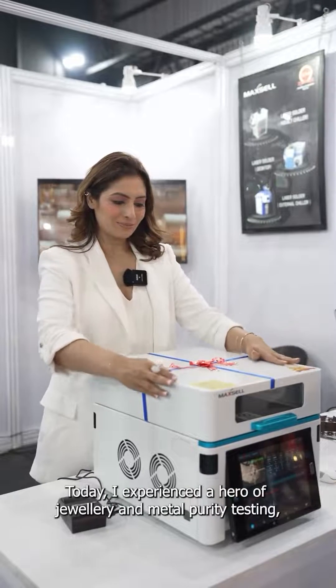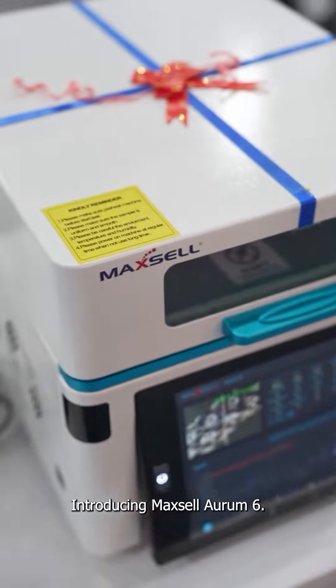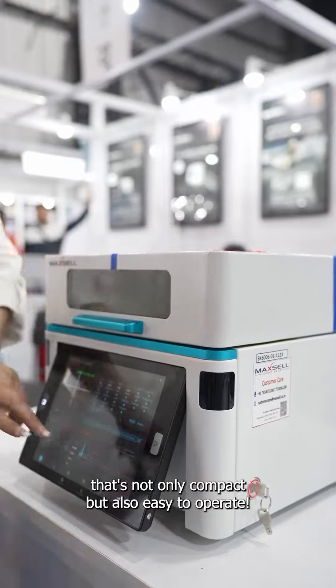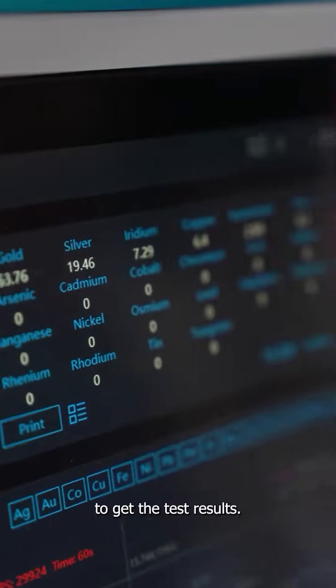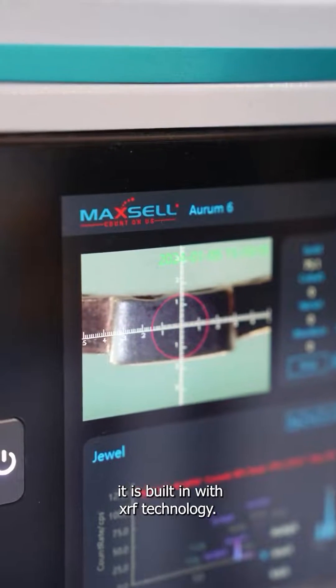Today I experienced a hero of jewellery and metal purity testing — introducing Maxil Aurum 6. So why this? A metal and jewellery purity testing machine that's not only compact but also easy to operate. You no longer need to melt your ornament to get the test results. While this magical machine works its science, it is built in with XRF technology.